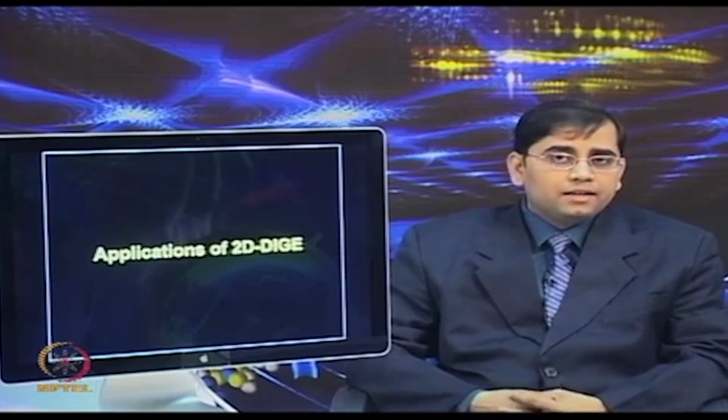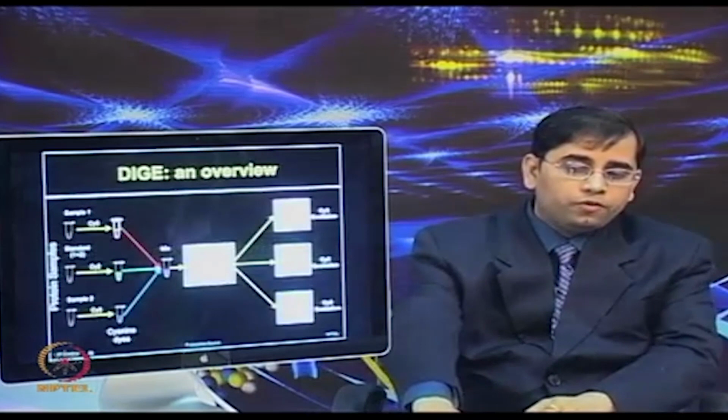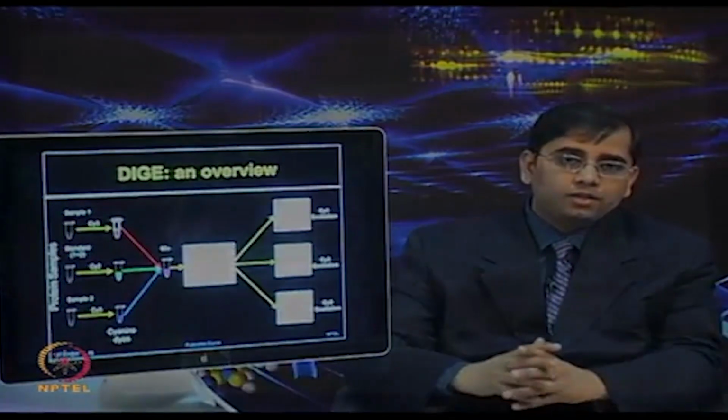So, let us look at some case studies on 2-dimensional difference in gel electrophoresis. But before we touch upon the case studies, let me give you an overview of the DIGE technique.